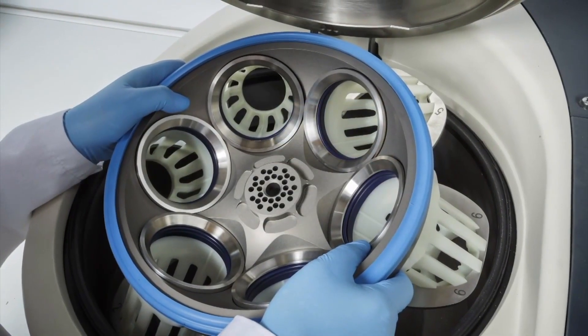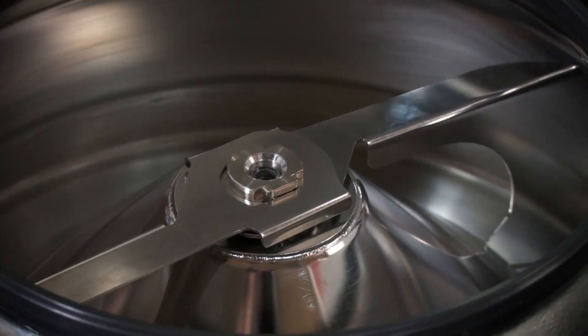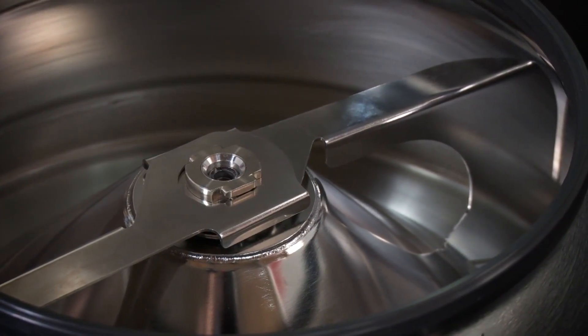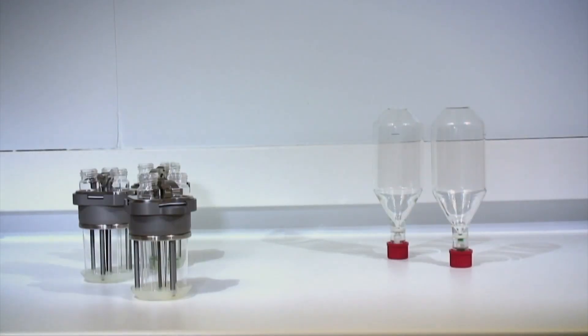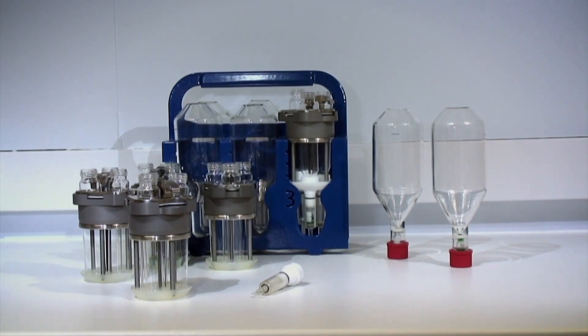The latest rocket synergy series offers the unique flexibility of interchangeable rotors, enabling processing of a wide range of sample volumes in a single system.